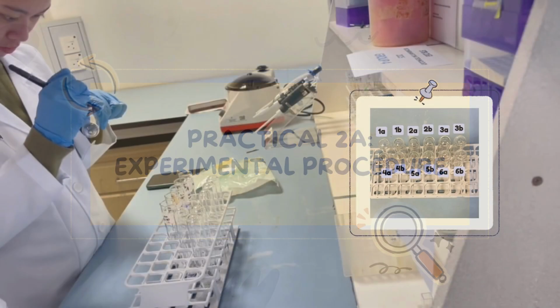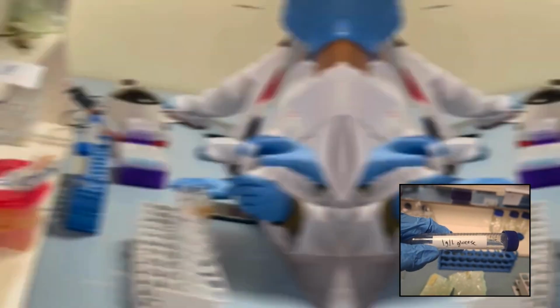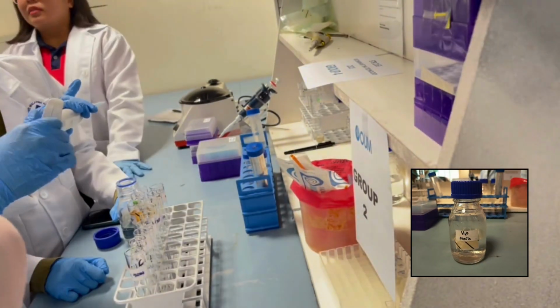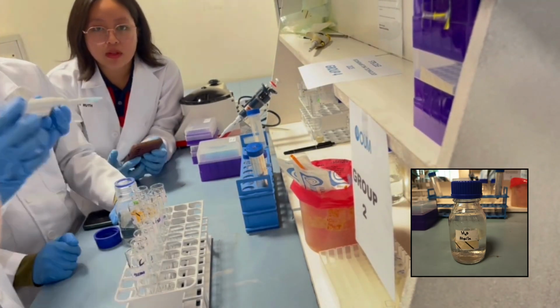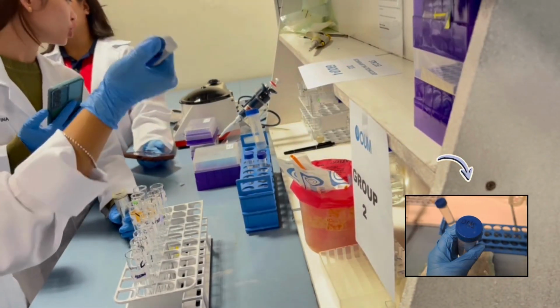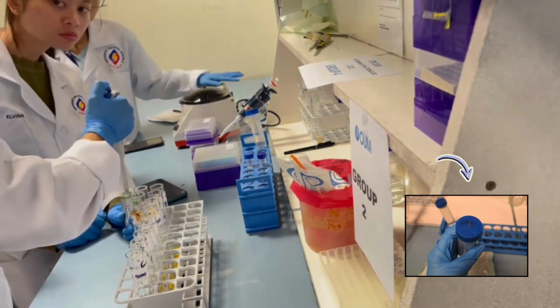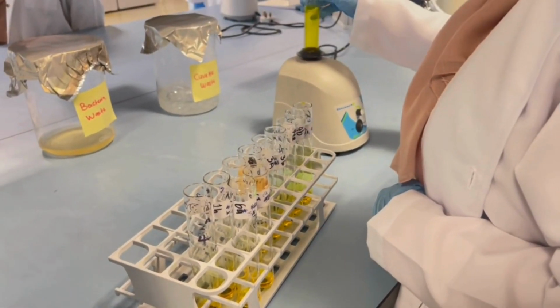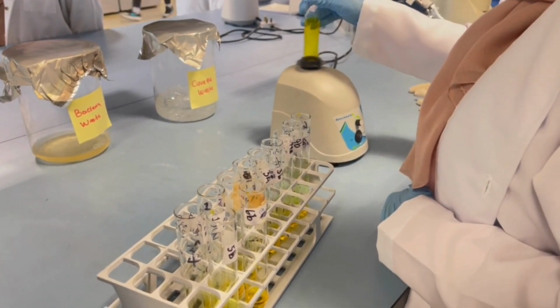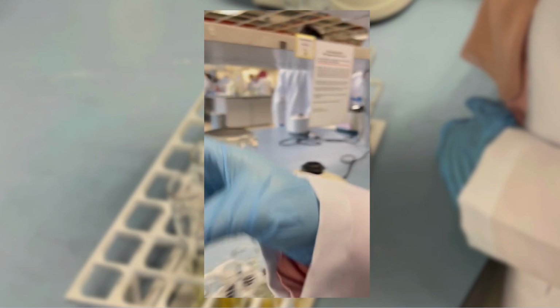Practical 2A, experimental procedure. The first step, all reagents including distilled water, glucose solution, and the DNS reagent are pipetted in duplicate into a series of dry clean test tubes labeled 1 to 6. Next, the test tubes are shaken well to ensure the reactants are uniformly mixed for the reaction to proceed efficiently.